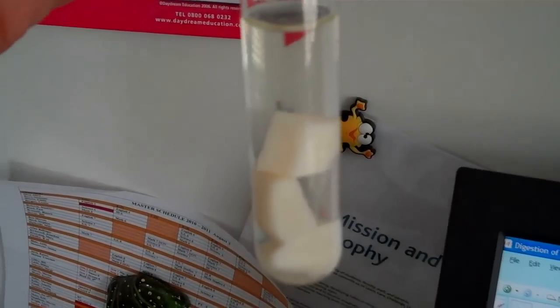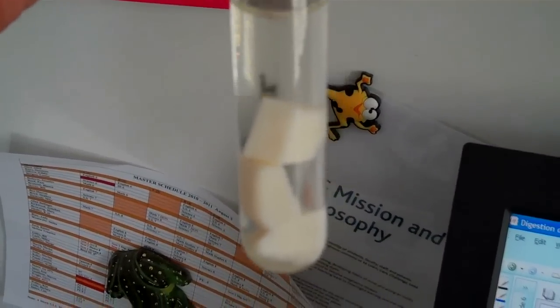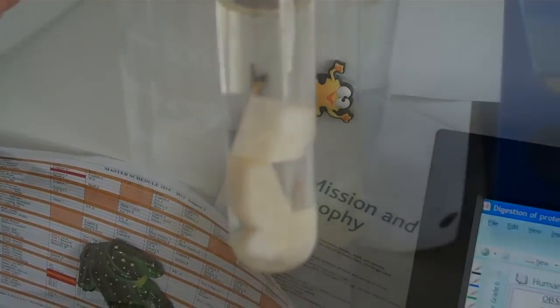So these three different test tubes of egg white with the different liquids, we'll leave them in the test tubes for a few days. Okay, so this is the digestion of protein lab, and we have left our egg white for more than a week now.